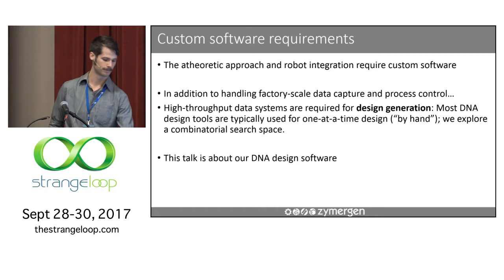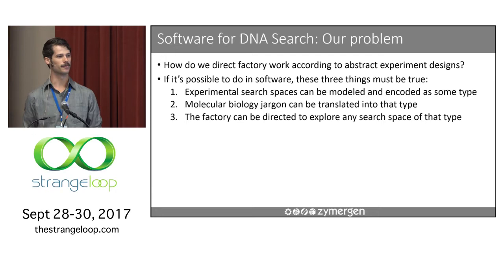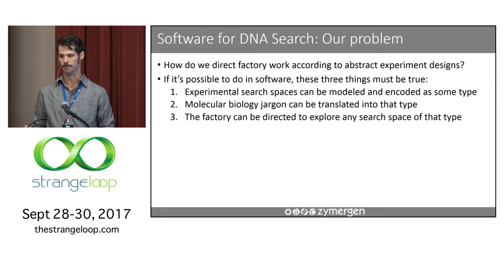That problem, more concisely put, is how do we direct the factory to perform the work necessary to carry out some abstract experiment design? In claiming that we can do this, there are three implications that go along with that. For one, there must be some way that we can take this very abstract notion of an experiment and put it into some data type. This is a claim in itself because our experiments are potentially very complex. They potentially vary quite a bit from one experiment to the next. And any given experiment might change a lot in the future. We don't necessarily know what the logic behind some next experiment might be.